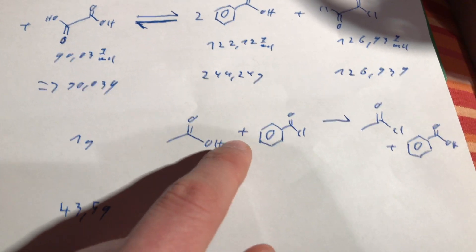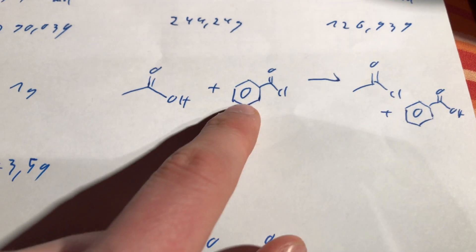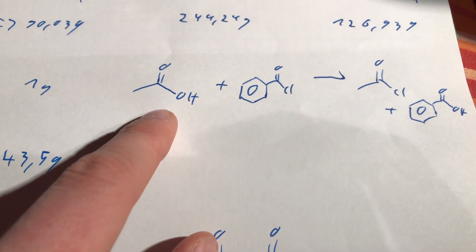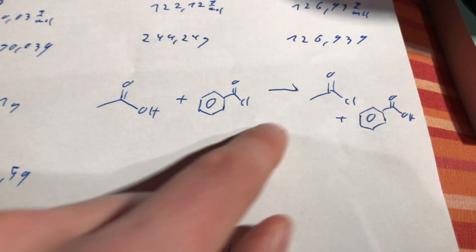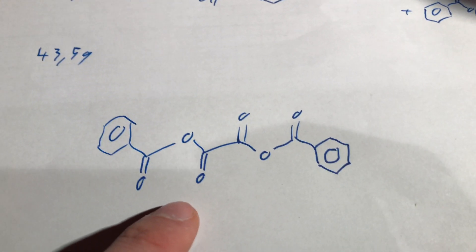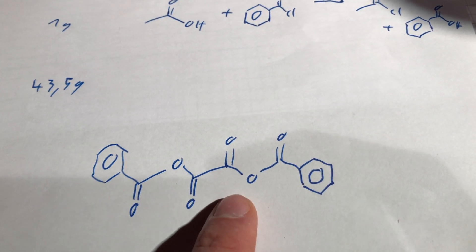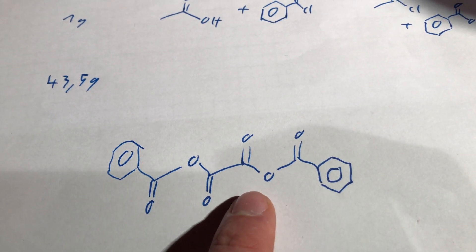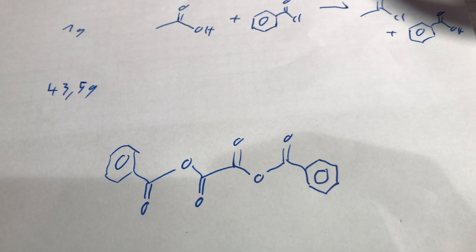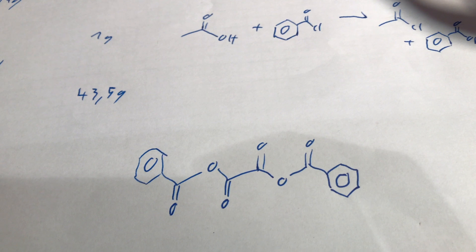Normally you can make low boiling acid chlorides using this method. You add some benzoyl chloride, whatever acid, and you simply distill off the acid chloride while benzoic acid remains behind. But I guess what happened is that we got a mixed anhydride, because the amount of hydrogen chloride generated was massive.